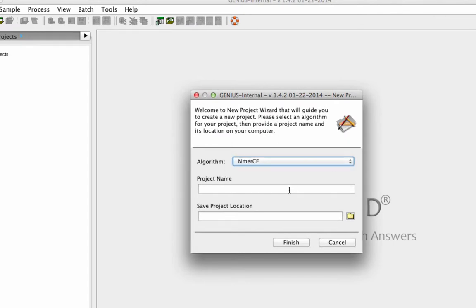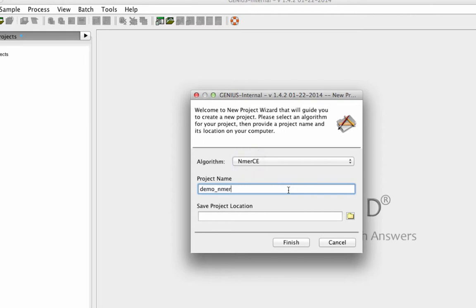Now let's walk through a project starting with the NmerCE algorithm to demonstrate how a metagenomic sample is analyzed in Genius.